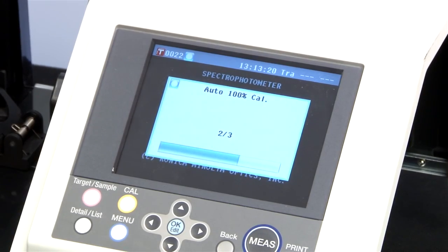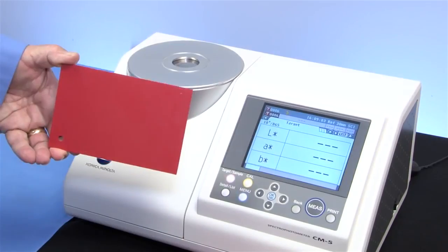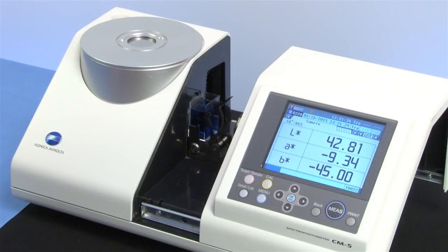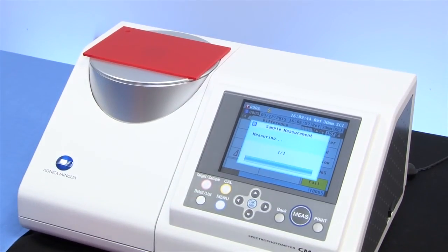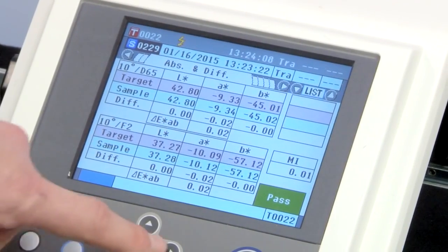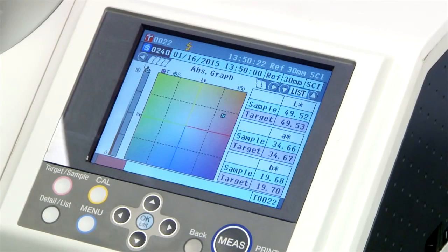After calibration, place your sample on the top port or in the selected transmittance sample holder and press the measurement button. What could be easier? Scroll through a variety of results including LAB color difference, 3D color space, and spectral curve.